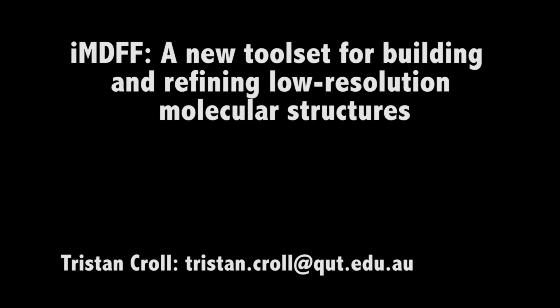A big part of the problem here is that most crystallographic model building tools were built with those high-resolution datasets in mind and struggle when the map no longer gives the position of each atom. I developed the toolset I'm about to demonstrate specifically to improve how we work with low-resolution structures. I call it Interactive Molecular Dynamics Flexible Fitting, or iMDFF.